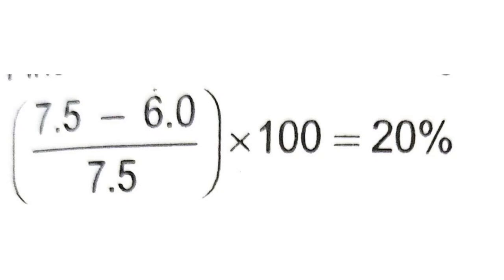Now, there are some points to note in this experiment. Number 1 is the apparatus are allowed to cool before taking the final reading because gases expand when heated.